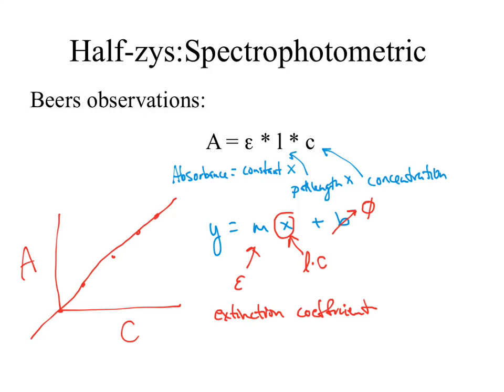We can test its absorbance. And let's say our unknown has that absorbance. What does that mean its concentration is? We now know the concentration of that sample. Once we know the concentration, we can back calculate how much copper was in that individual sample. It requires a bunch of unit conversions, molarities, all that sort of fun stuff. When we actually have numbers to work with, we can run through some sample calculations.